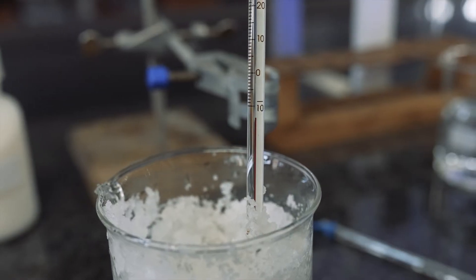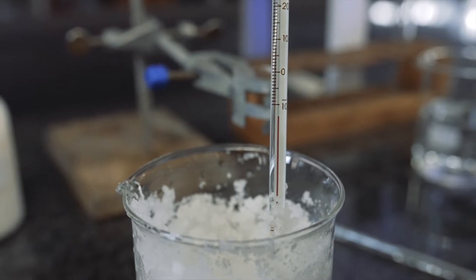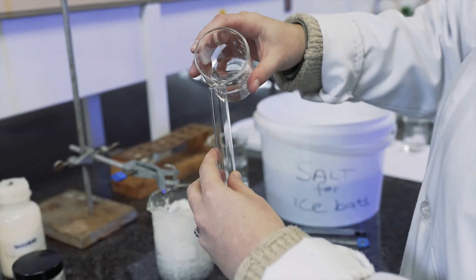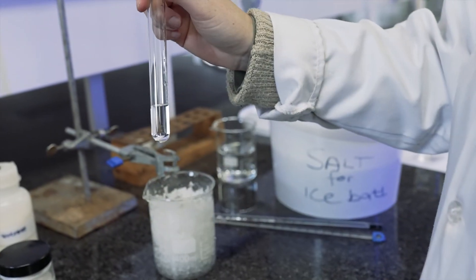Now that we've added our salt to the ice, you can see that the temperature has dropped even below minus 10 degrees, which is perfect for our experiment. We're going to add about two centimeters cubed of our magnesium chloride solution and then place it in the ice bath.